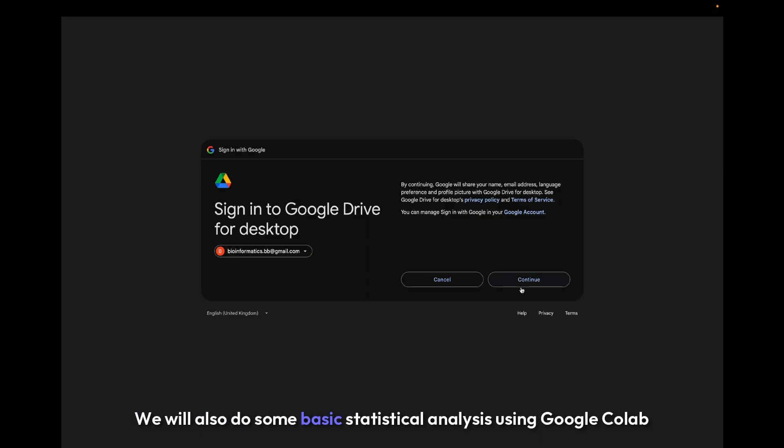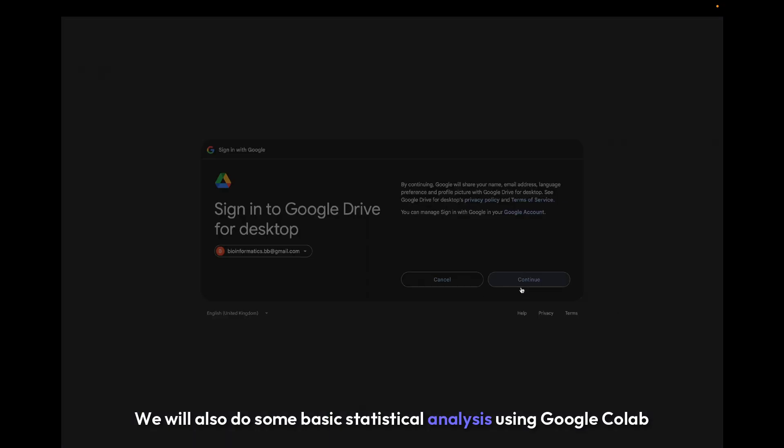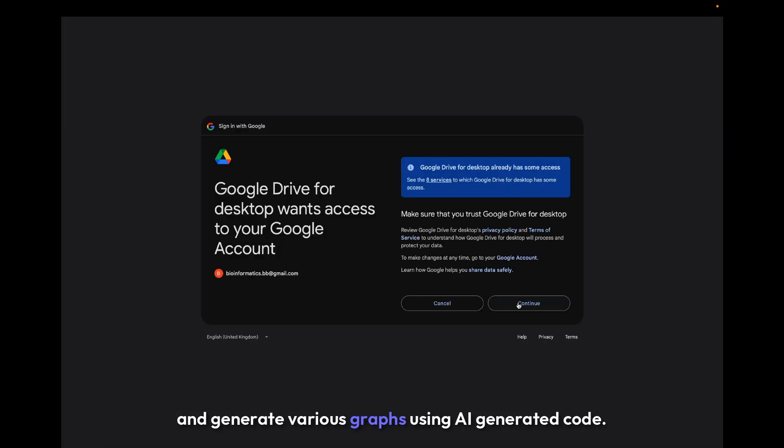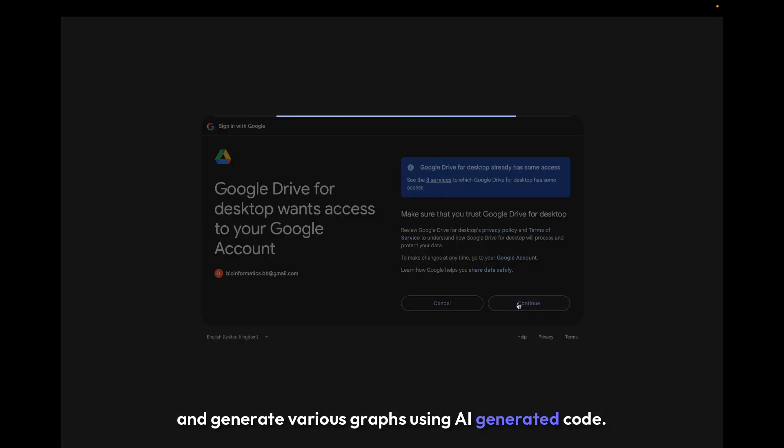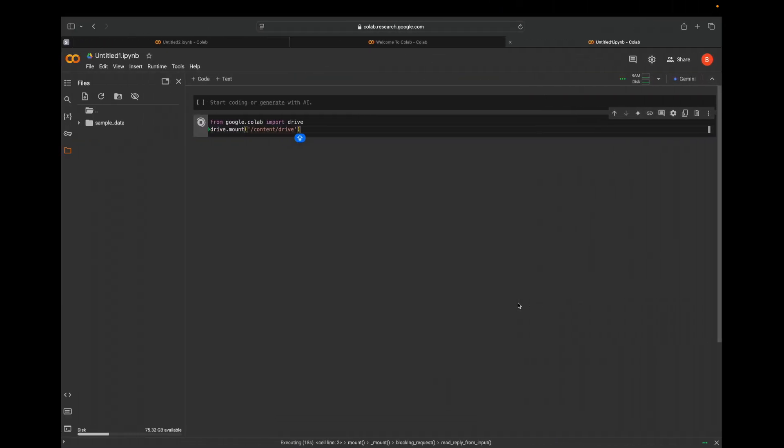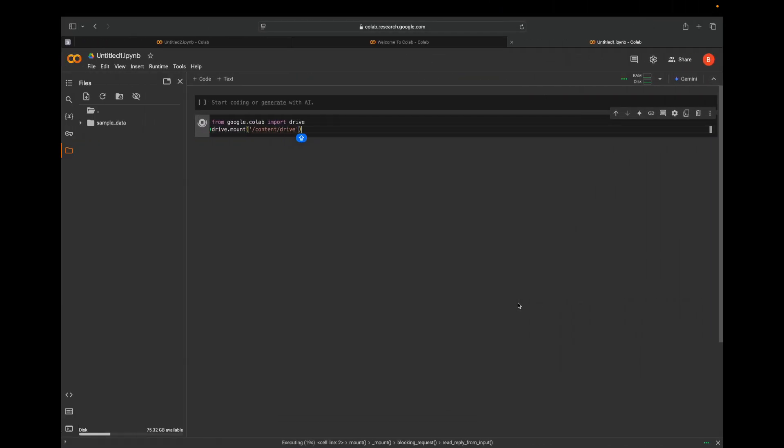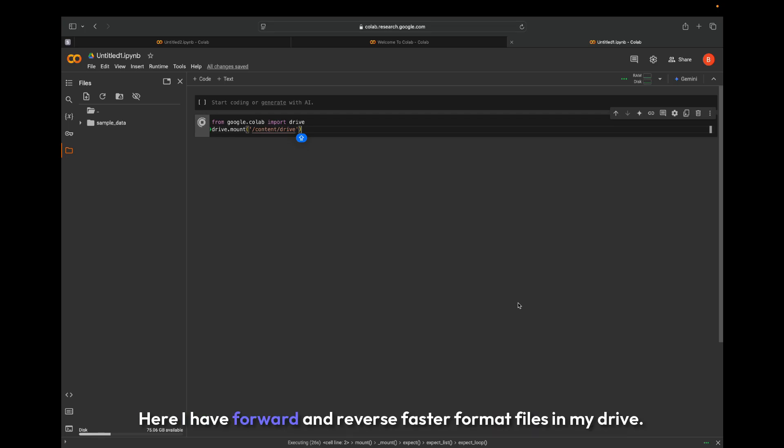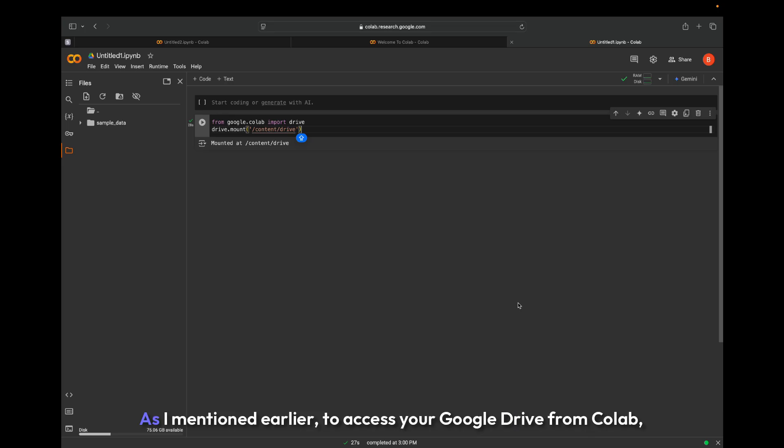And generate various graphs using AI-generated code. For FastQC analysis, we need an input file in FASTQ format. Here I have forward and reverse FASTQ format files in my Drive.